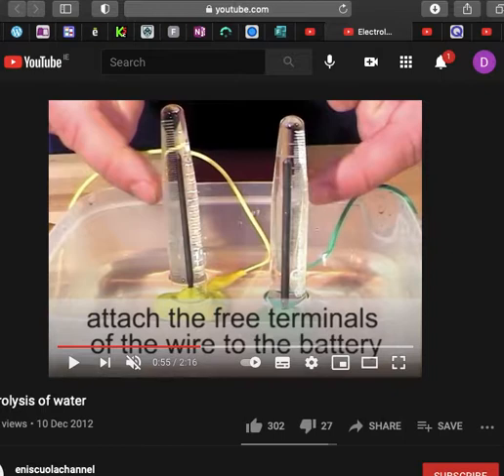Don't remember, don't care. Okay, so what the Hoffman voltameter is, it's essentially like two funky burettes, but they're linked together. You would have your electrodes down at the bottom, and a little tap up the top because you want to tap the gas off.